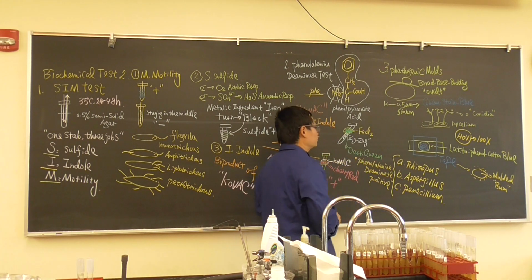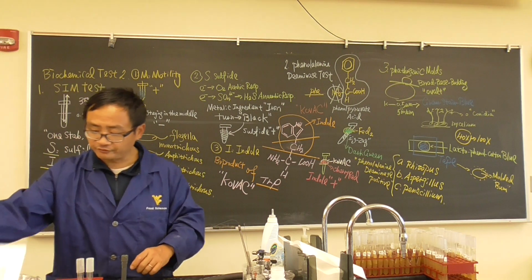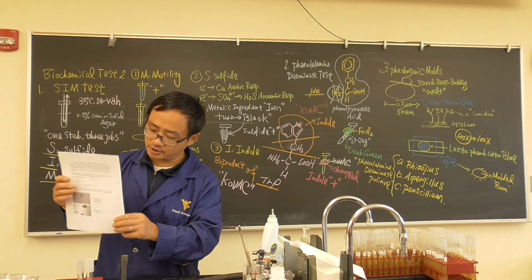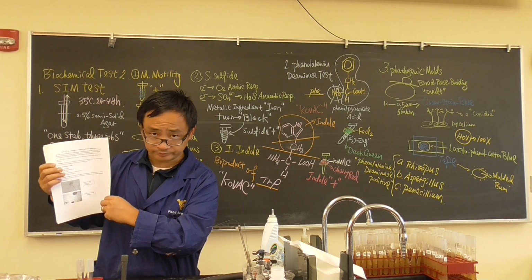Those are the three we want to find. You can compare the morphology, which is on here, and determine what type of mold it is.